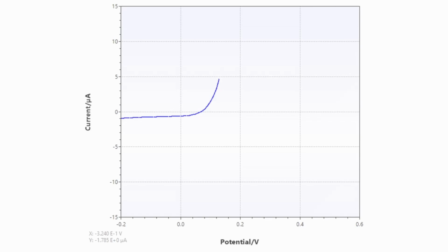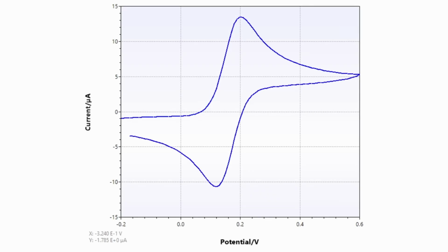on experimental design. So, when we're measuring cyclic voltammetry, we apply a potential to the working electrode that is changing linearly with time, from a starting position to a switch point and then back again. And during this time, we're continuously monitoring the current that is flowing through the working electrode. Here is a cyclic voltammogram of ferrocene methanol on a glassy carbon electrode.